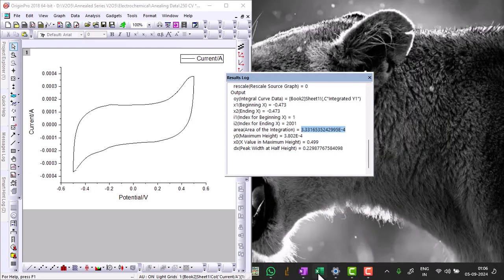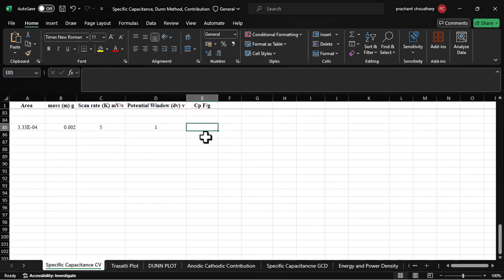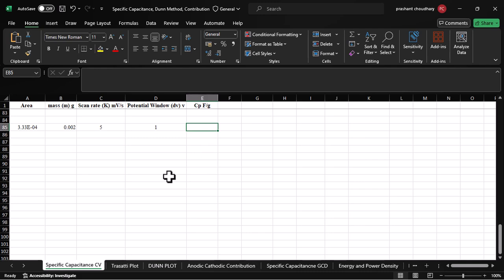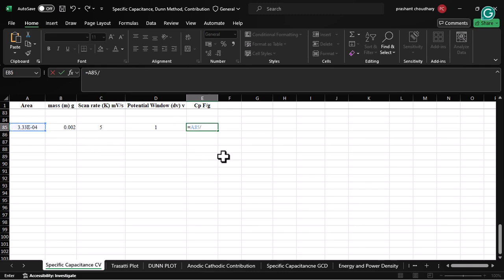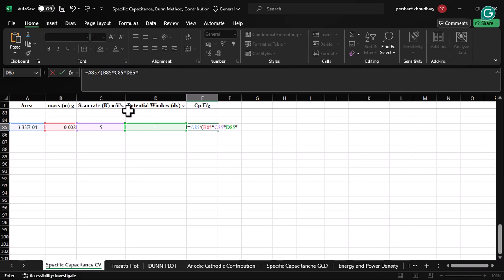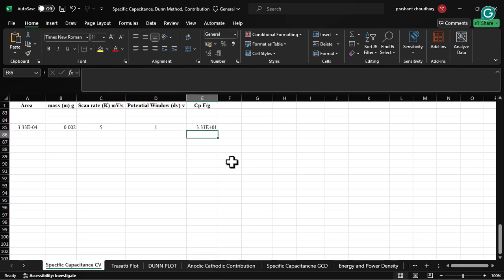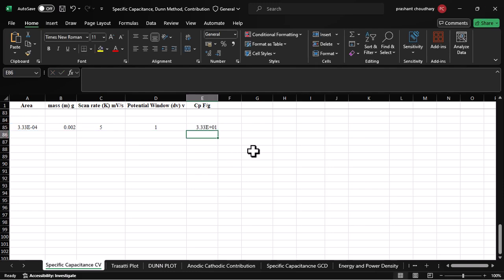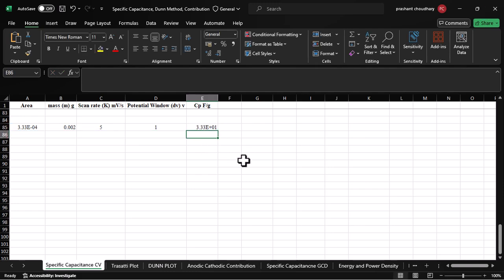The formula is: area divided by mass, multiplied by scan rate, multiplied by potential window. Since we're using mass in grams, we need to convert millivolts to volts, so I'm multiplying by 10 to the power of minus 3. This gives you the value of specific capacitance.